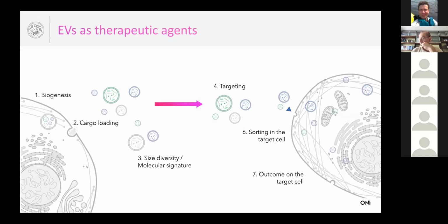Now, EVs are biological messengers that transport active molecules between cells. Their ability to be taken up by cells and alter gene expression makes them especially interesting for therapeutic purposes. However, studying them has been very limited because they are so small and lie well below the diffraction limit. On top of this, they're found typically in biofluids that are heterogeneous in nature and contain a host of different factors. Therefore, they require really elaborate purification steps to ensure successful isolations of these different subpopulations.